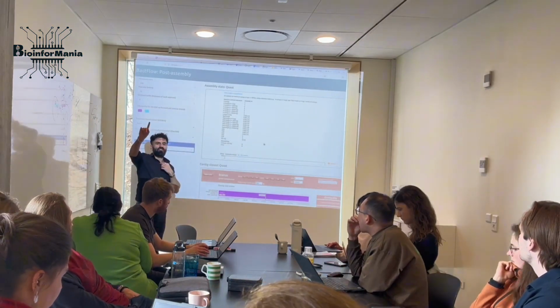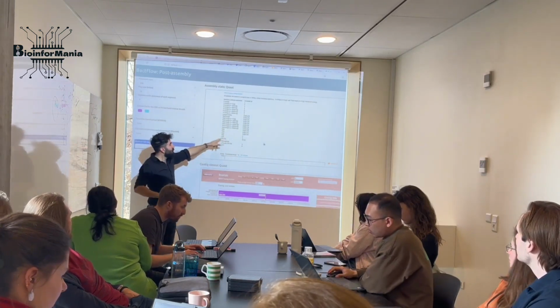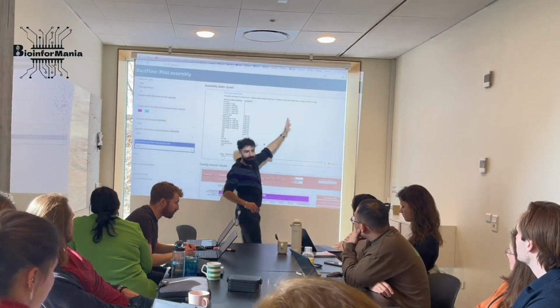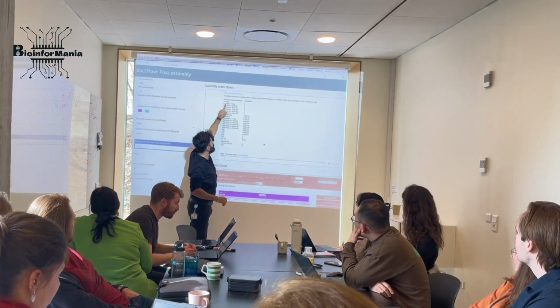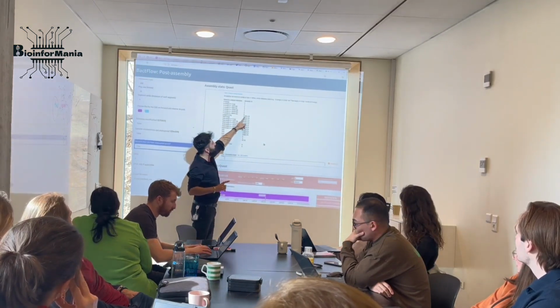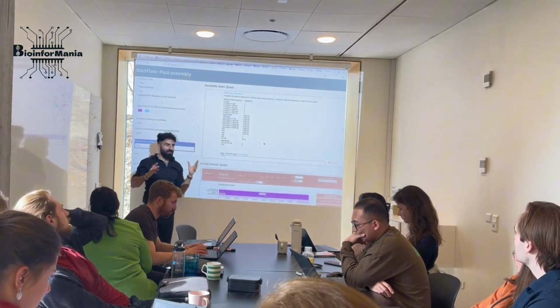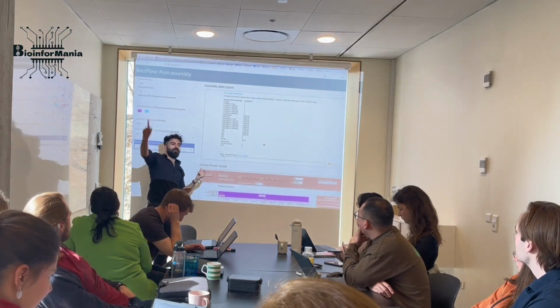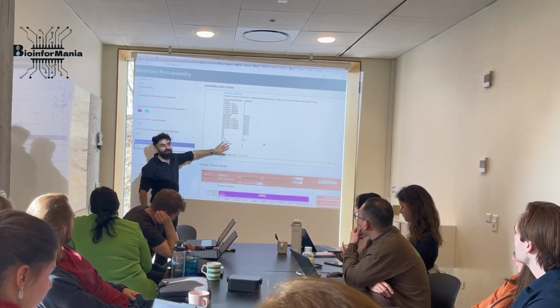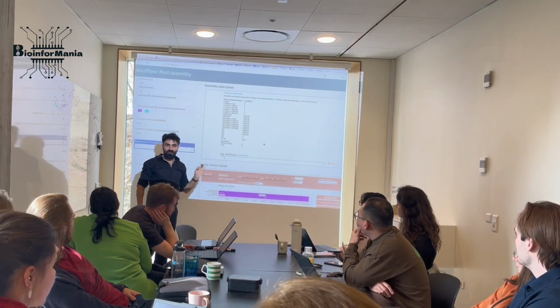I have only one genome in this case, okay? This is something I just made as a dummy thing. If you had several other genomes, it would be here, okay? Each column with one genome. So it's telling you this genome is only one contig of the length 2.06 million. This is great. It is completely contiguous, one contig, one whole genome. And I'm pretty sure we know this species, it doesn't have any plasmid. So one contig, perfect assembly.